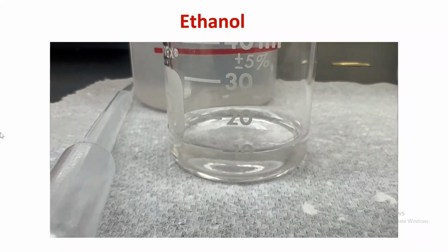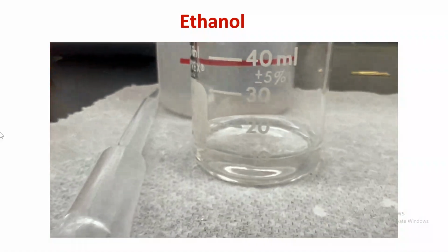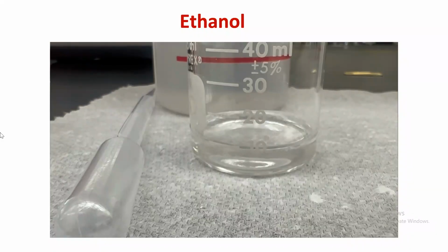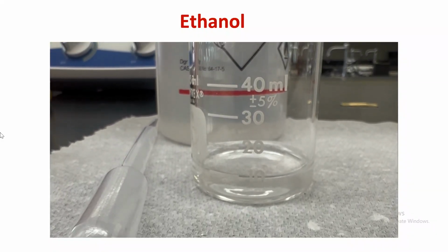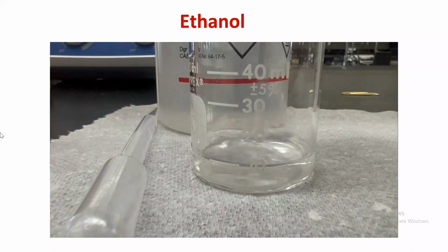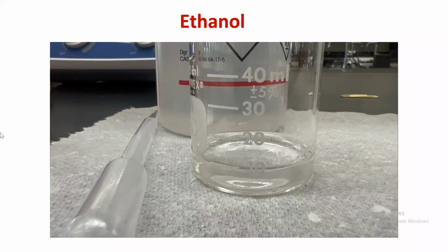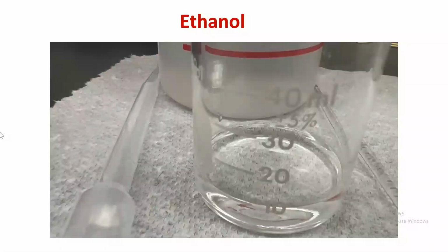So for the first observation, you can say no layering. You don't see any layer. Now, if you only see one layer, what are we going to conclude? Is it miscible or is it immiscible? Yes, it is miscible. Miscible means they mix. You can remember MM. Miscible means they mix.